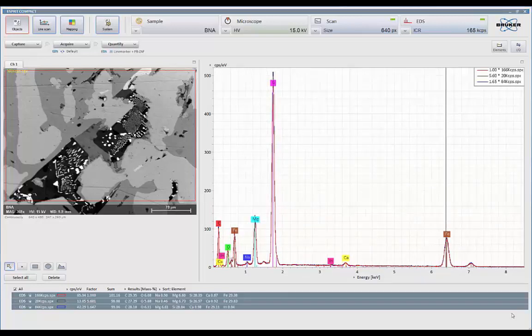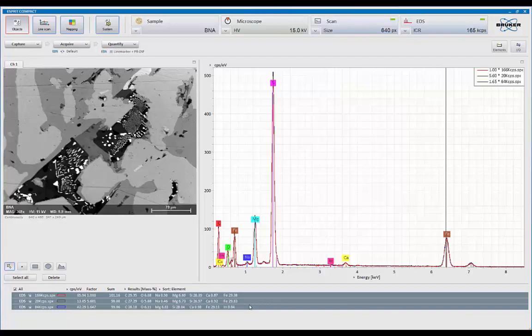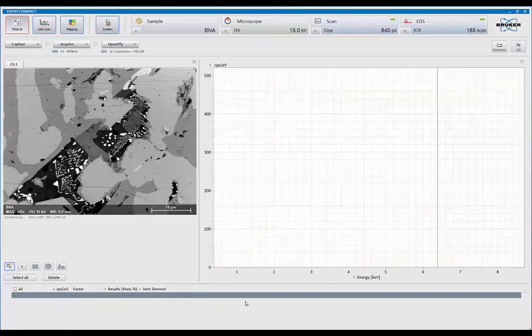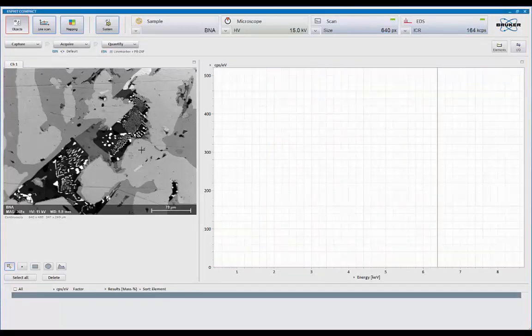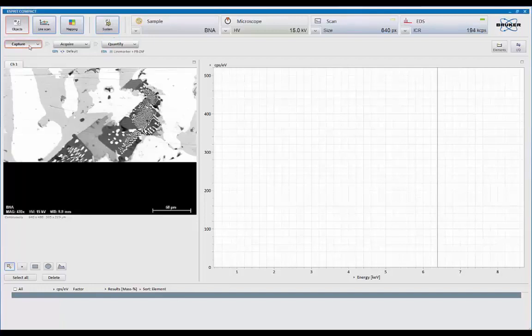One of the most common analysis that people want to do is quantitation. Now, the system has been doing that on the fly. We can also be interactive with our quant data. So we can come through here and actually see exactly how quant has made those choices for us.